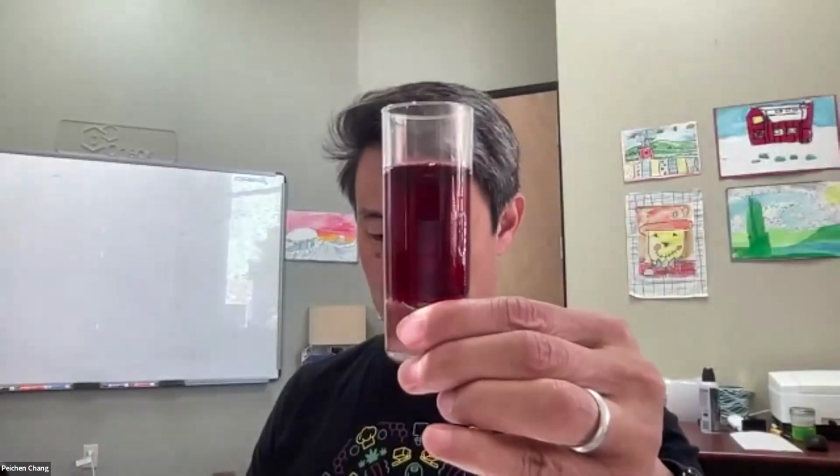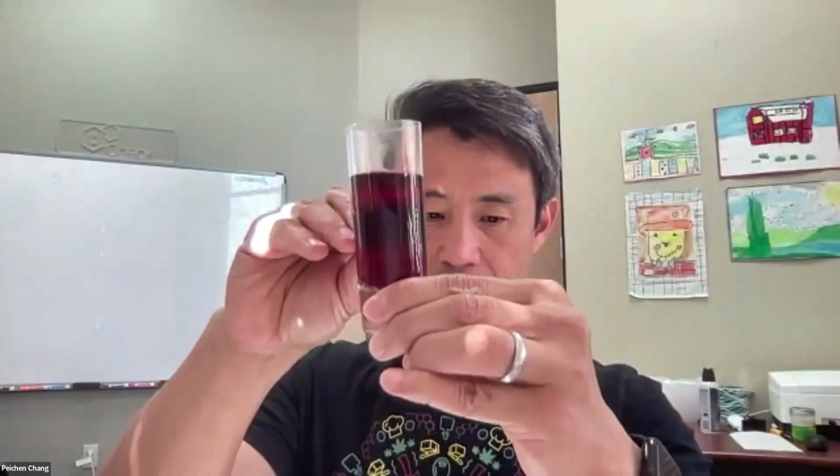And so if I were to shine a red laser through it, you should be able to see that pretty well. Okay, but if I shine a blue laser through it, you really can't see it hardly at all. Okay, and that's because the red color filters out or absorbs the blue color very, very readily.